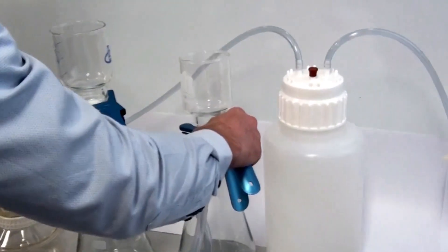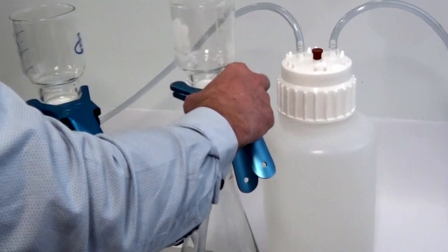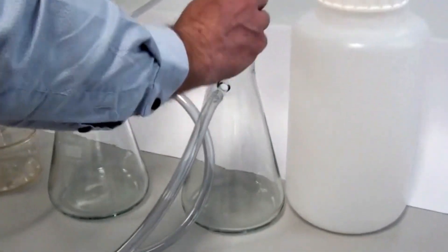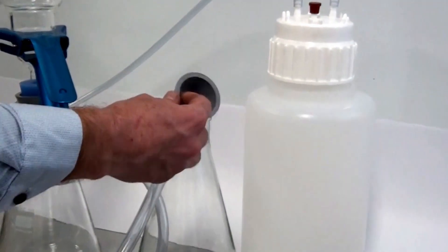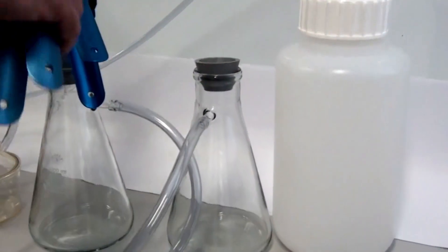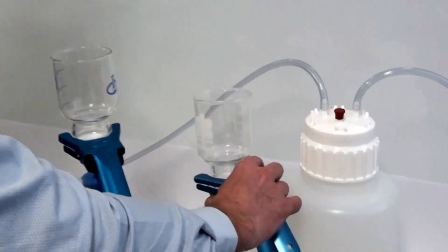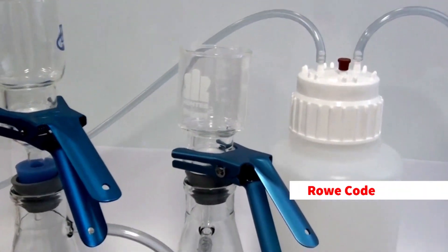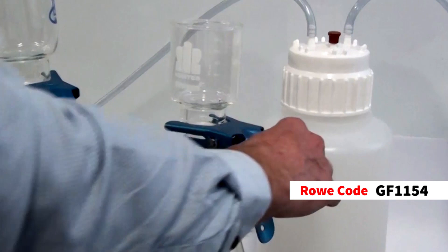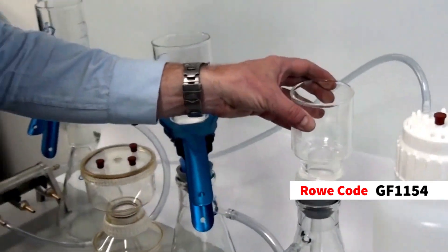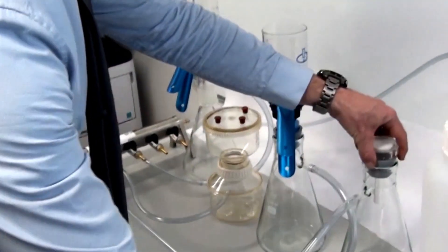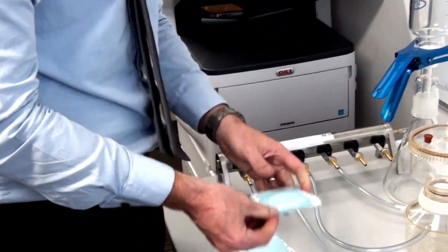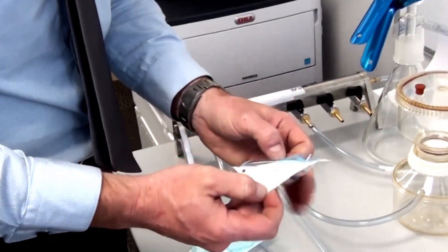And lastly, we've got the same setup, but with a different top half. So we've got the GF3310, the HS2246 Gooch seal. And on top, we have the Kimble filter holder, which is our code GF1154. I will pop a membrane on top, and then we will fire it up.